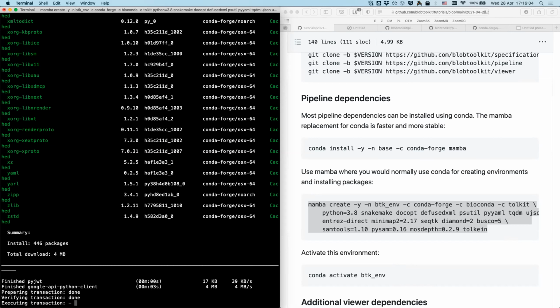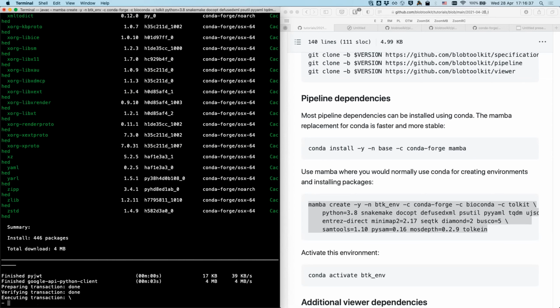So I'm still doing the conda install step. Oh, the first one. Yeah. Right. It just took some time, but it's working fine. Yeah, this is exactly what I noticed as well, that conda install is very, very slow. And this is why I was so happy when I discovered Mamba. Mine is a lot faster because I already had done this once before, so it had everything cached. But I think you will also find if you're running through all the downloads, that it's much quicker than conda for the same thing.